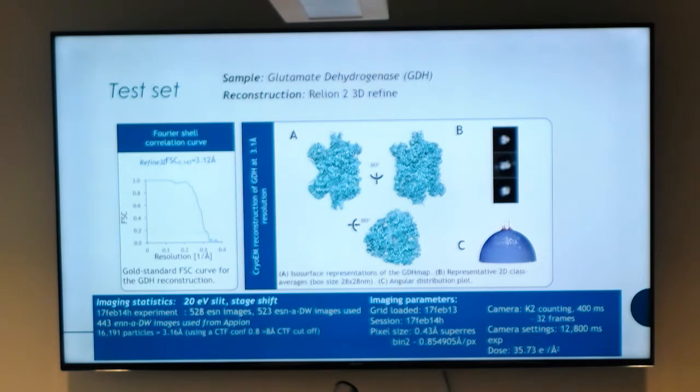Something of note would be if, let's say, you have a pixel size that is not completely calibrated, so you have a nominal pixel size that's close, and you want to reprocess your data with a calibrated pixel size, you want to make sure you just don't update the star file with the pixel size. You would want to rerun CTF estimation at the new pixel size. If you don't, you'll run into some trouble.